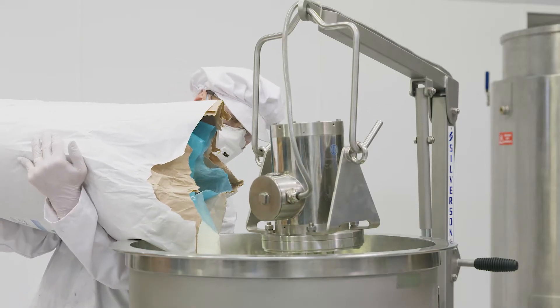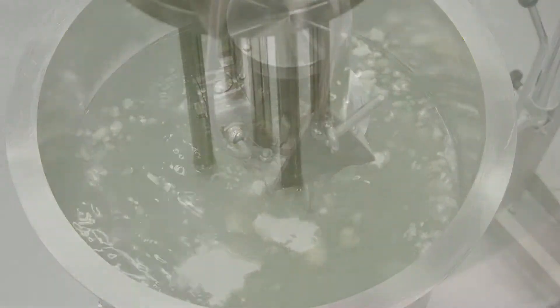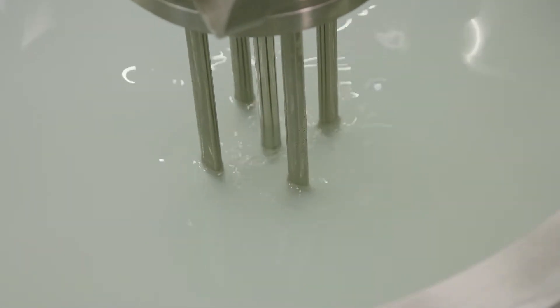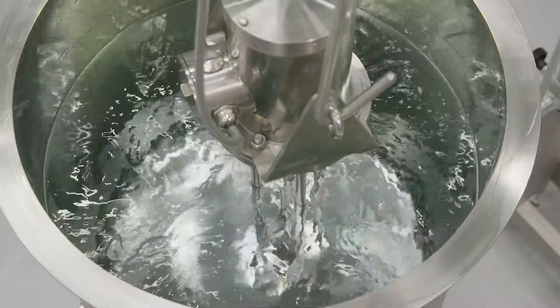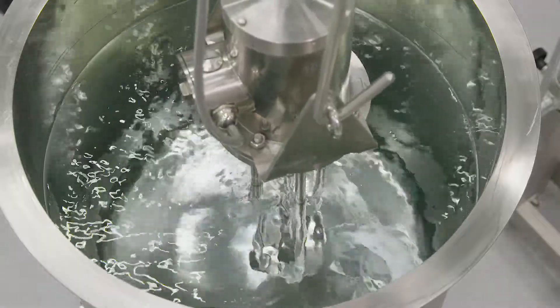The same mixer is often used for dispersion of tablet-binding agents such as HPMC. Silverson mixers are easily cleaned between batches or when changing colors, and can be customized to incorporate CIP systems.